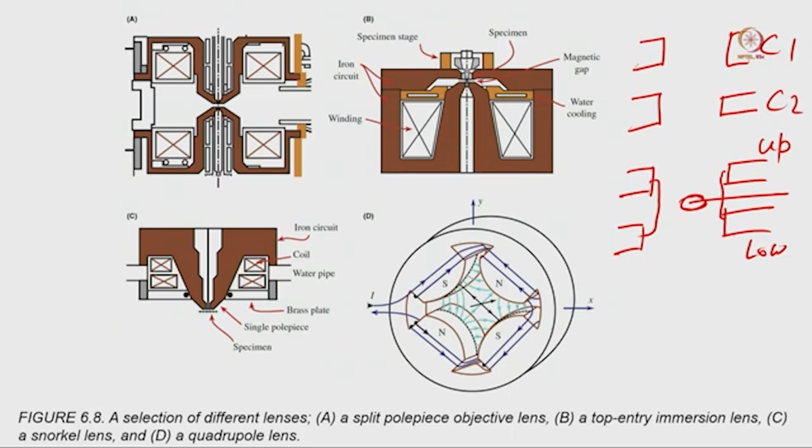So this is going to regulate the electron beam, how much electron beam is going to fall on your sample. Is it going to spread all over like that, or are you trying to focus on one particular point, so that the entire beam is not exposed? So there are two possibilities. The electron beam can follow this crossover point and illuminate the entire sample, or we use the crossover point in such a way that it will just focus on the sample. So here, based on these two lens systems, we can regulate this electron beam.